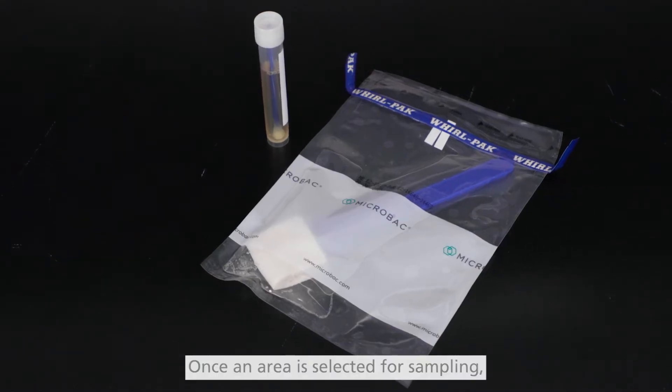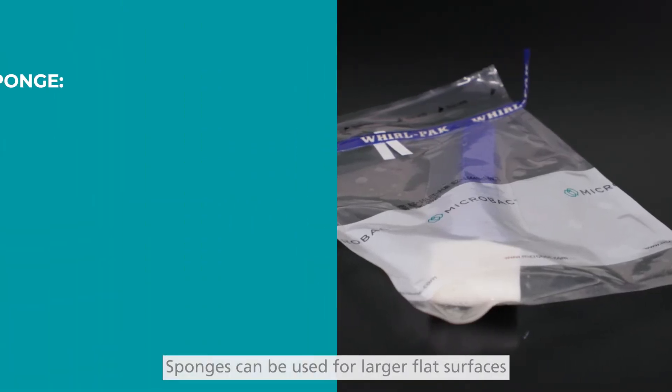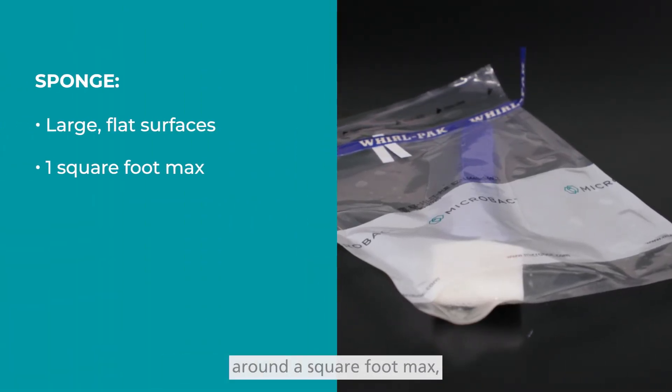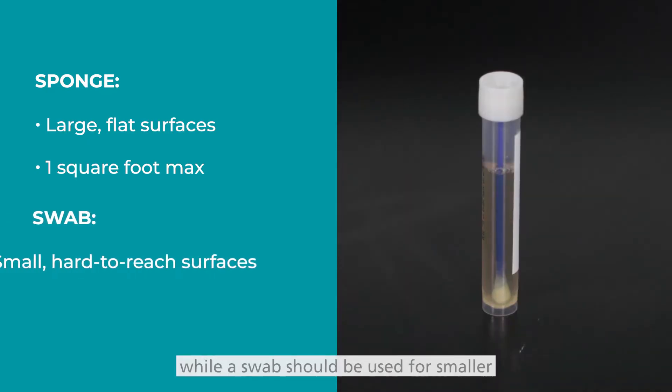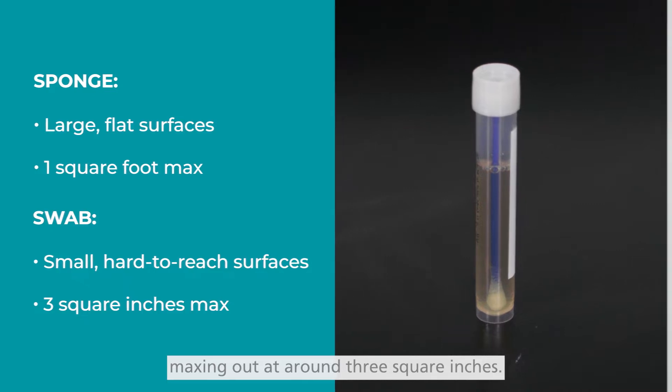Once an area is selected for sampling, a sponge or swab is used to sample the surface. Sponges can be used for larger flat surfaces around a square foot max, while a swab should be used for smaller or harder to reach surfaces, maxing out at around three square inches.